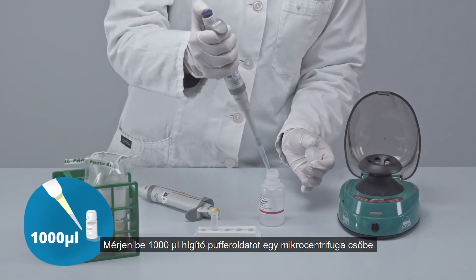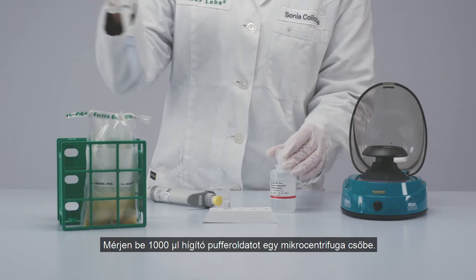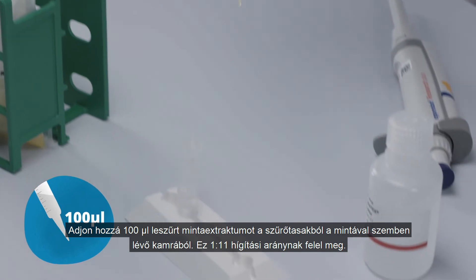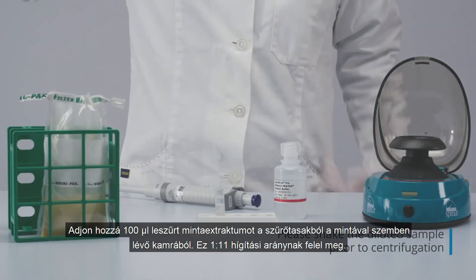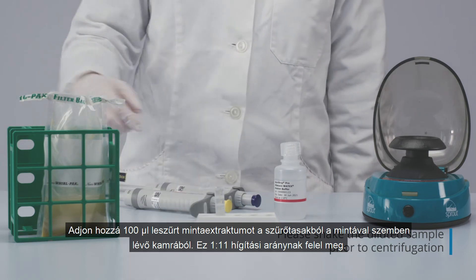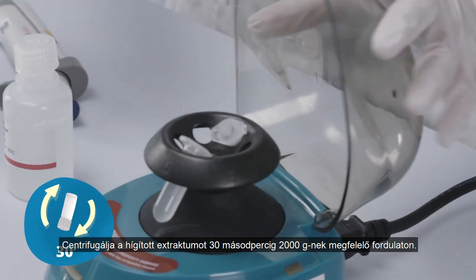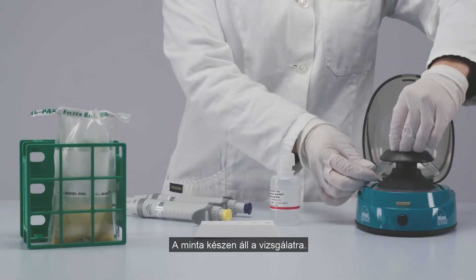Add 1000 microliters of dilution buffer to a microcentrifuge tube. Transfer 100 microliters of sample extract supernatant from the side of the filter bag opposite the sample to the microcentrifuge tube. This represents a 1 to 11 dilution ratio. Centrifuge the diluted sample for 30 seconds and the supernatant is ready for testing.